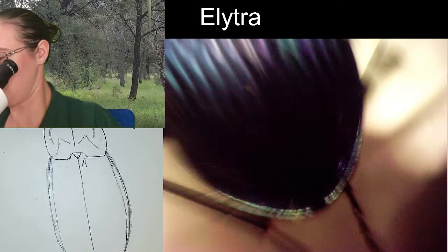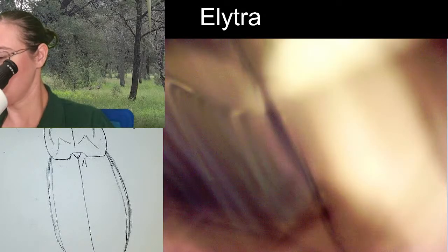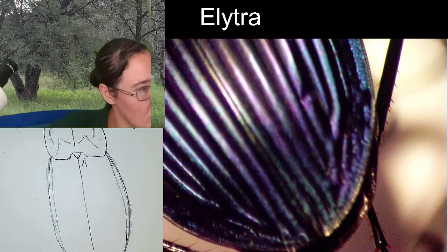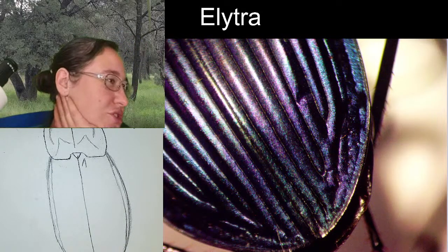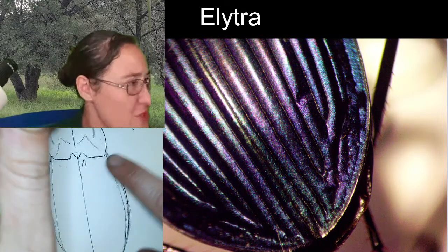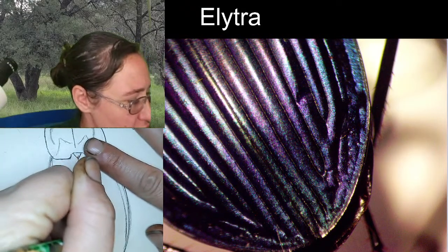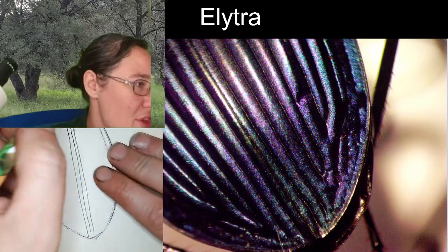Let's see where they end. It's a little trickier to see where they end. I gotta shift it. Cool. Just so pretty. Okay. So the first 2, they meet up at the top. They run parallel. They come down and they end at the end here, but they don't connect. They don't reconnect back together at the end. They kind of stay separate. But then the next.